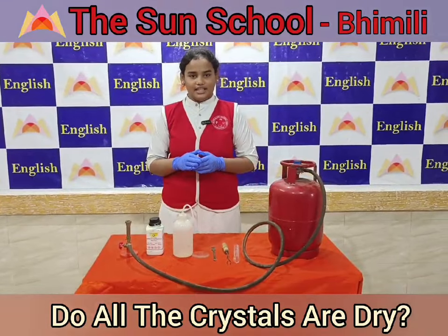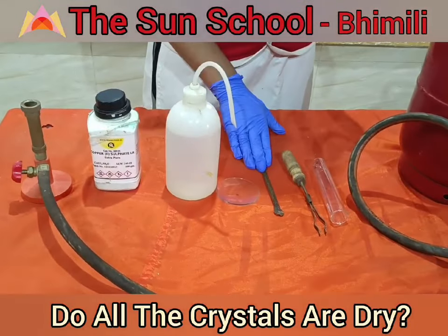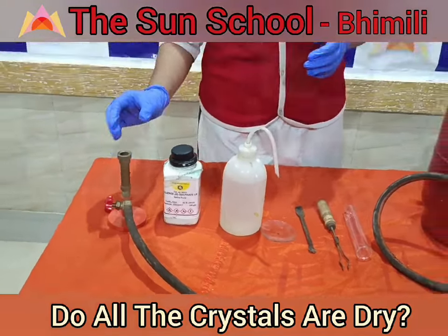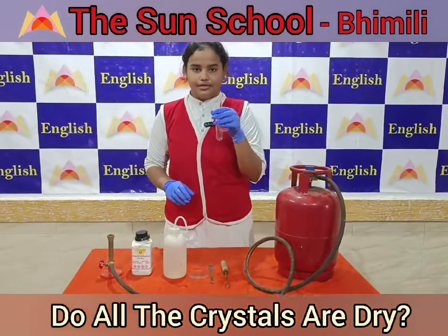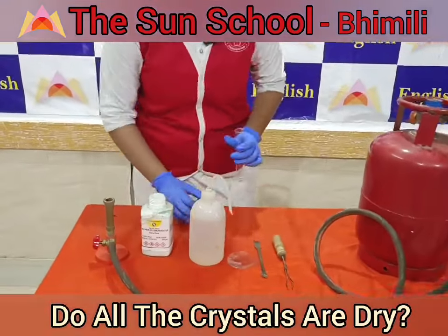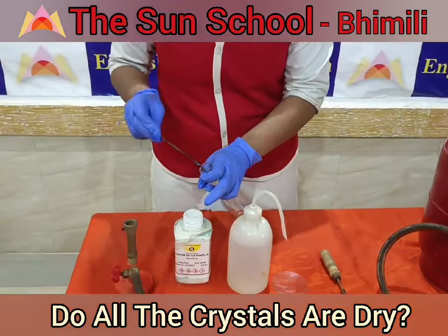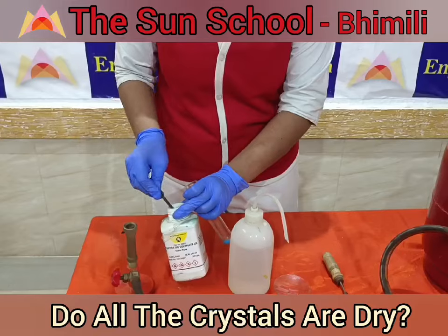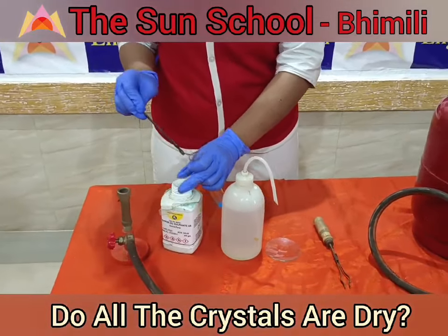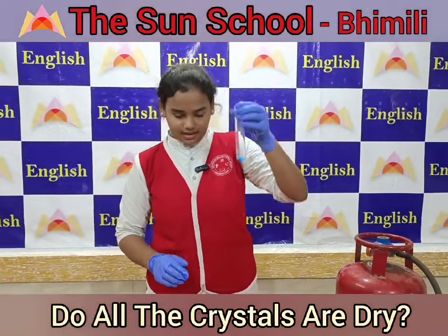Here I have taken some materials like copper sulfate, distilled water, a watch glass, a spatula, a test tube holder, a boiling test tube and a burner. Take the boiling test tube and add a few crystals of copper sulfate to it. We can observe that the color of the crystal is blue.